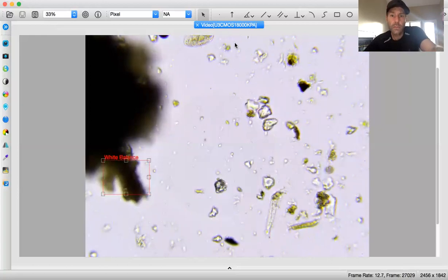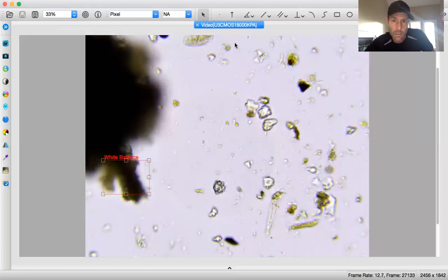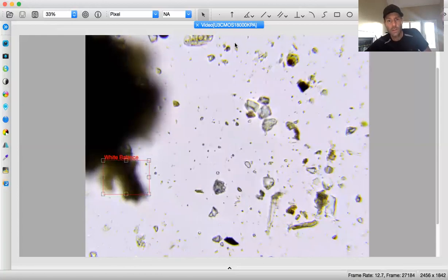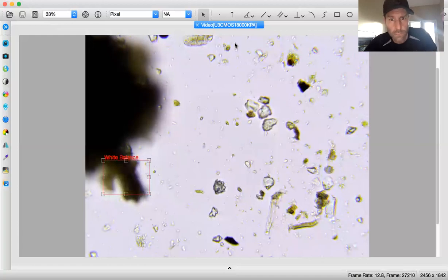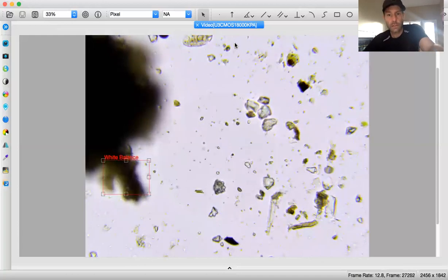It looks like it's a little nodal, but I think that's actually actino floating. It might be a bacillus, lactobacillus, but I don't think it is, though. No, that's not. So I'm going to count that as 0.075.